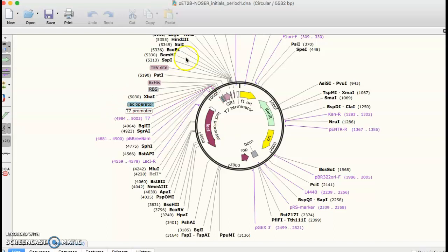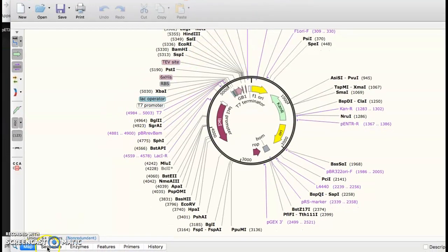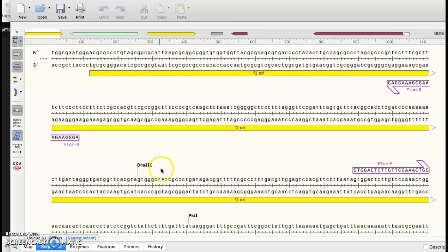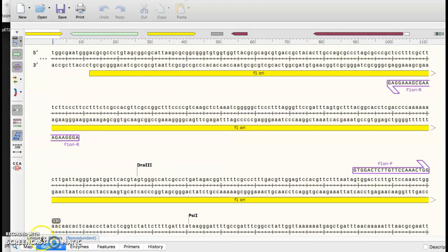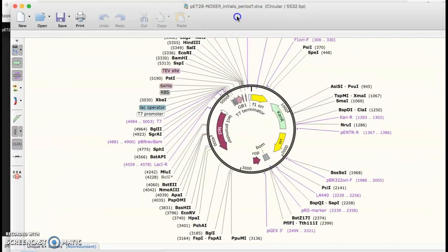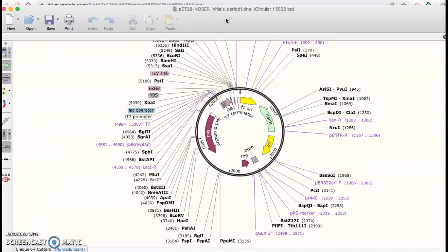And then just kind of explore around a little bit through SnapGene, write down any big questions maybe that you have as you kind of look at this data, things that you think maybe are important, jot those down, and then we're just going to have a class discussion. But really what I wanted you to do today, the main goals, are to download SnapGene and get your 2 plasmids that we're going to go ahead and use saved. Explore around a little bit just so you can get familiar with the software, and then we'll really dive into some details tomorrow. Okay? If you guys have any questions, make sure that you write those down so that we can talk about them in class.